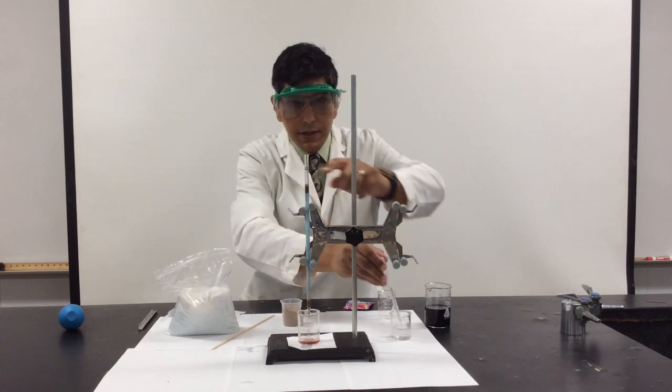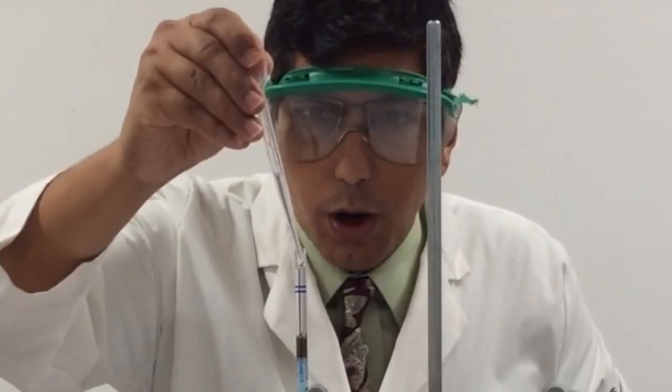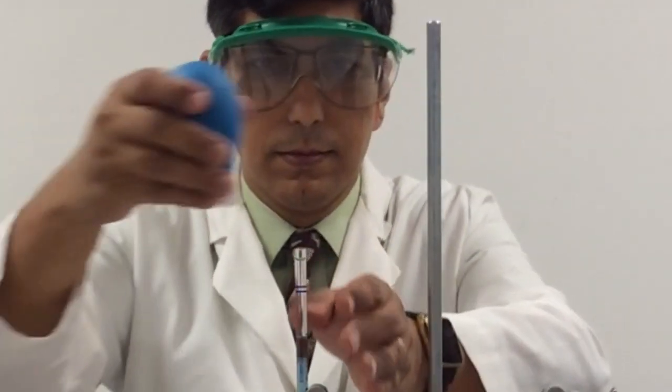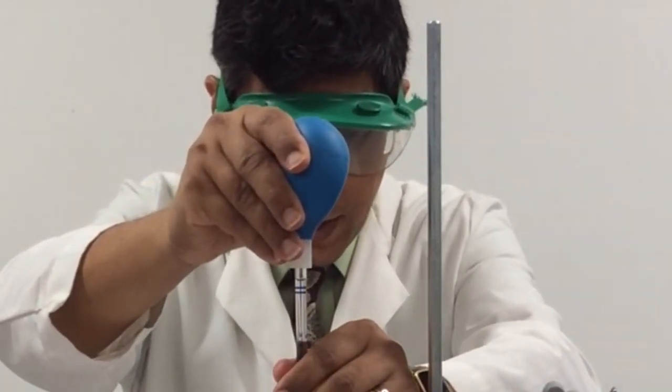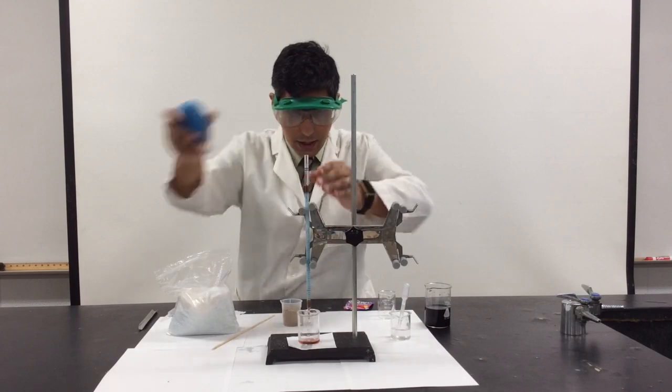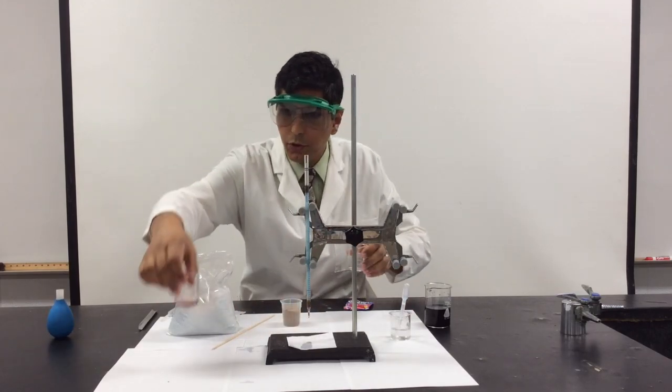Now you don't want the top of the column to dry out, so I'm going to continue adding distilled water to the top of the column. And at this time, it looks like all of the red dye has fallen through. So here we have the red.